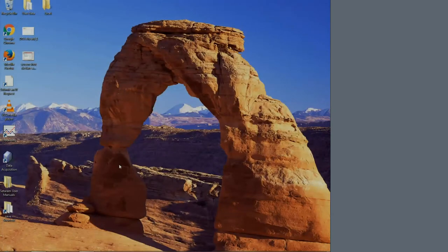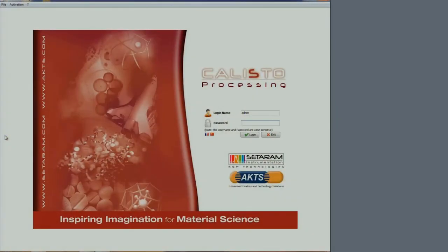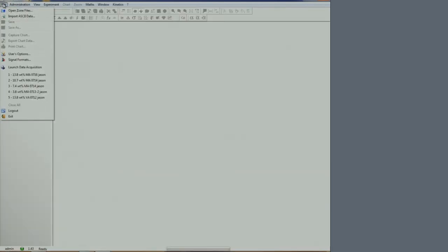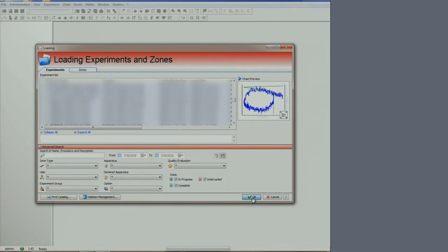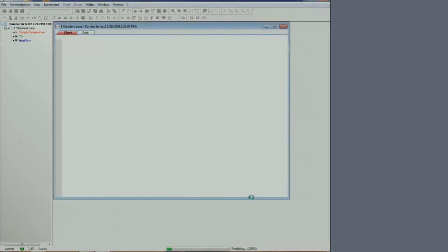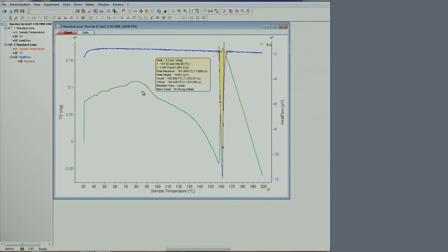Once you have collected the data, you can shrink the window and start the processing step. Open your zone file from the list of files. We have previously analyzed this dataset, so some processing already appears when opening the file. On the plot, in green is the mass, in blue is the heat flow.